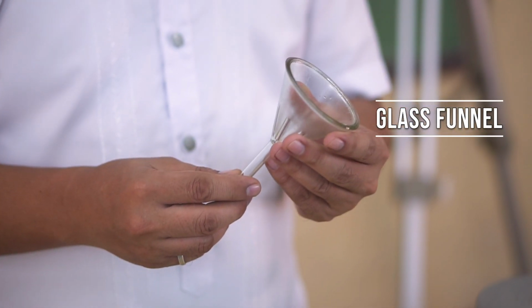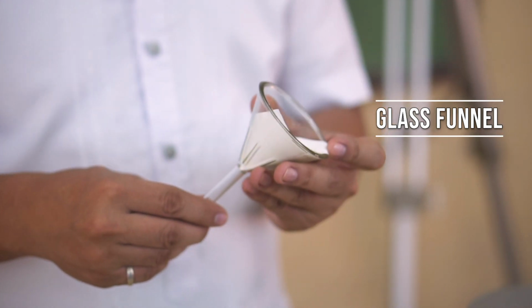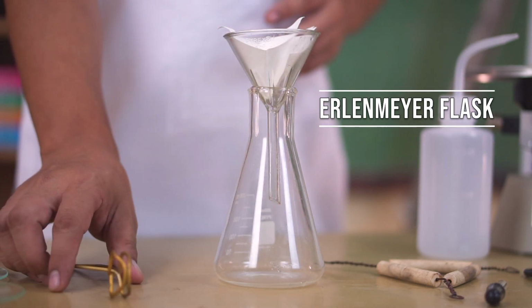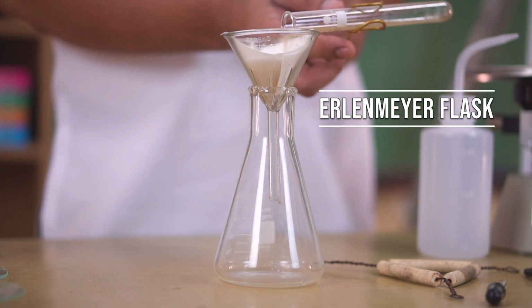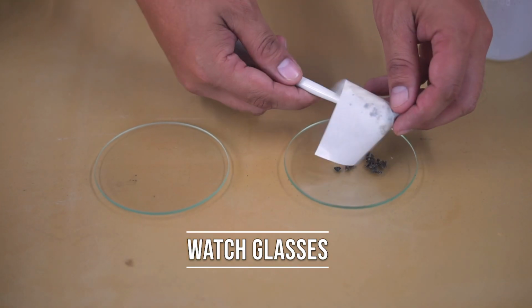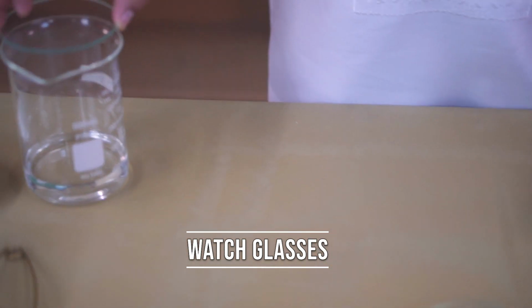Glass funnels are used for funneling liquids from one container to another or for filtering when equipped with filter paper. Erlenmeyer flasks are useful to contain reactions or to hold liquid samples. They are also useful to catch filtrates. Watch glasses are used for holding small samples. They are also used for covering beakers or evaporating dishes.